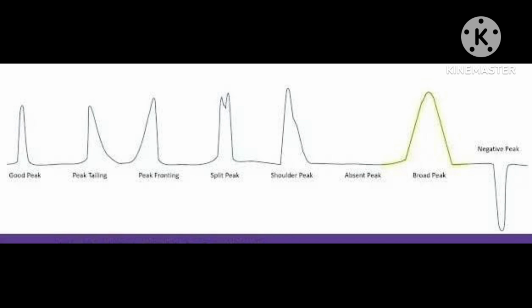Next one, negative peaks. Negative peaks in HPLC chromatogram, where peaks dip below the baseline, typically arise from differences in refractive index, absorbance or system issues like air bubbles or improper detector settings, rather than a true negative absorbance of the analyte.